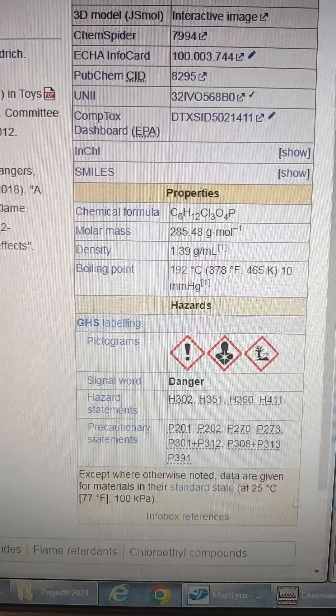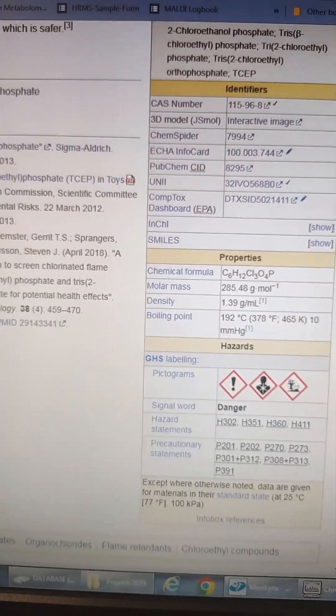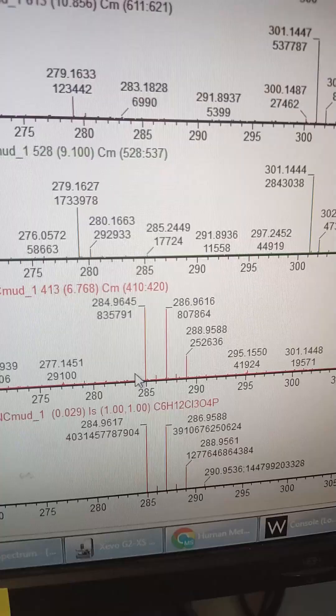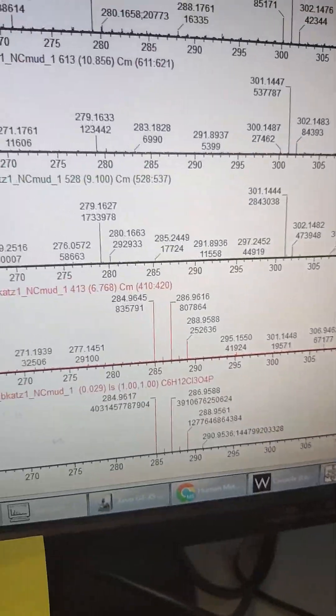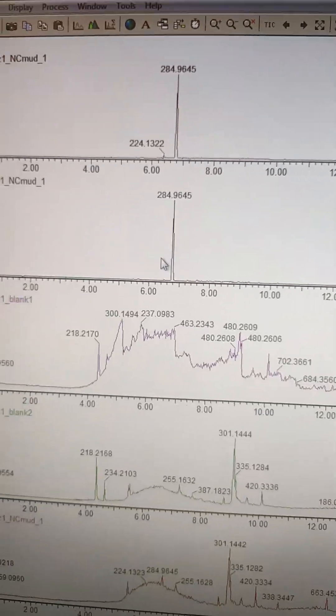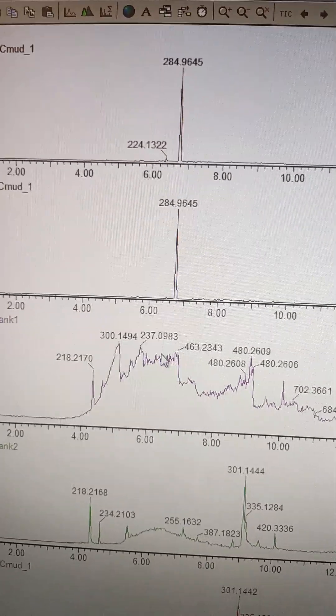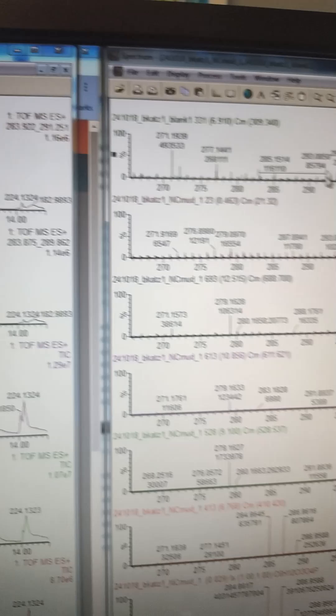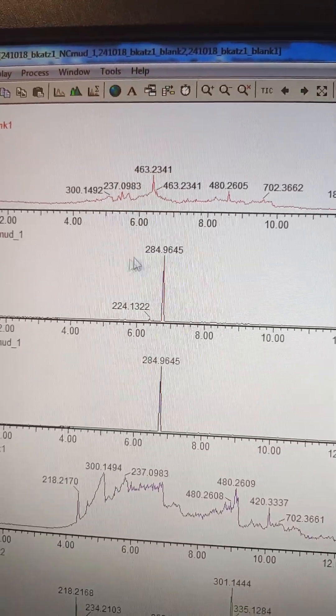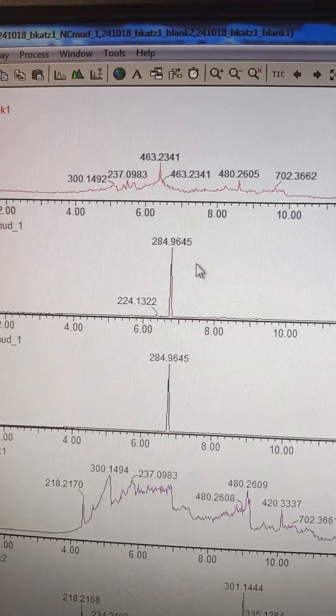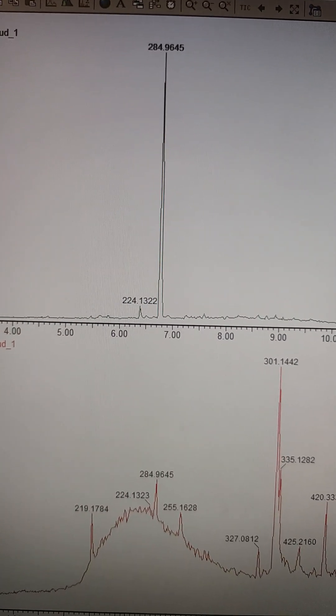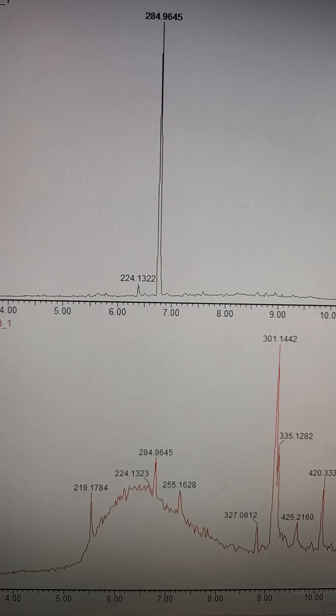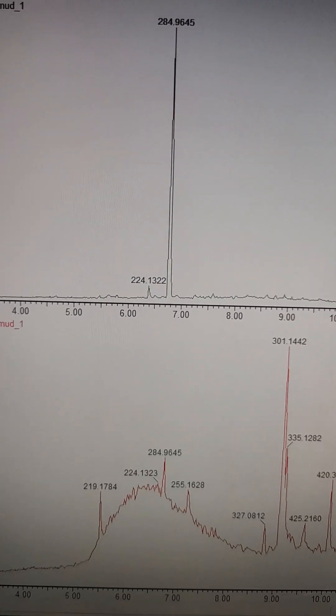If I found it in the mud, even though it's been diluted out that much with all that mud, there could be a good amount of this stuff. Someone should be checking for this officially. If we can drag across this TCEP peak, you can see that it is a really good peak. We look at it compared to the blanks. We extract across the blank region where that peak would be, and we're seeing no signal. This is definitely only in the mud sample. And stay tuned for part two, where we run all five individually located mud samples and see if we can figure out where that guy's coming from or if it's everywhere.